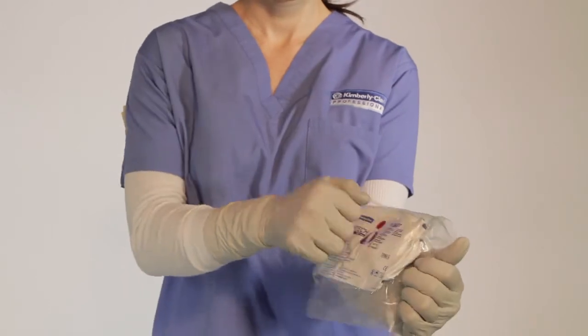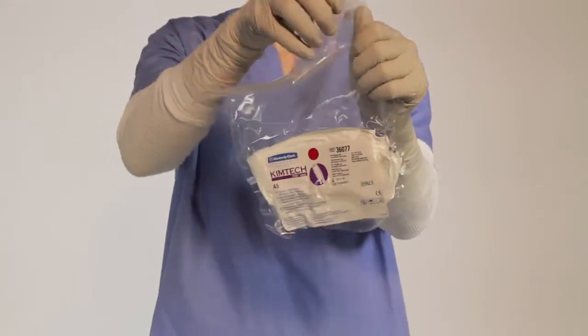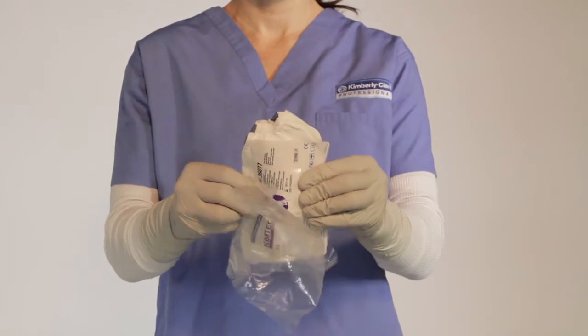Then, inspect the package for a vacuum seal. Locate the notches and tear towards the product to open. Flex the package gently to separate the sleeves.